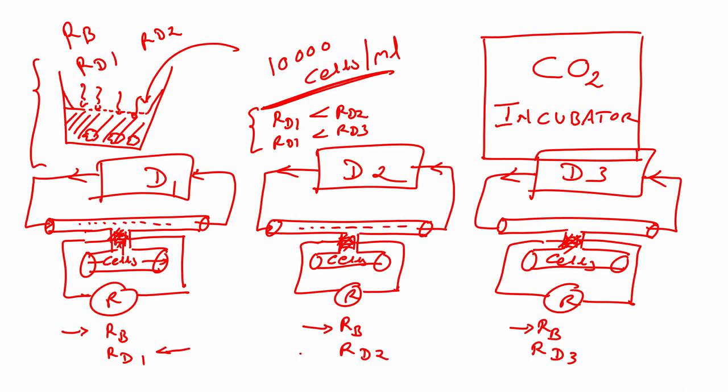And for the cells that we have extracted from the patients, we should use this particular microfluidic platform, and based on the microfluidic platform, we can select drug 1 over drug 2 and drug 3. That means we have screened which drug would be effective for a given patient.